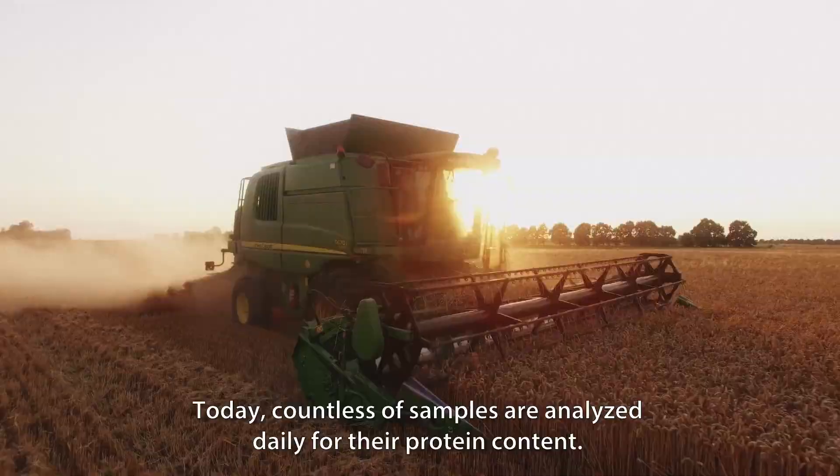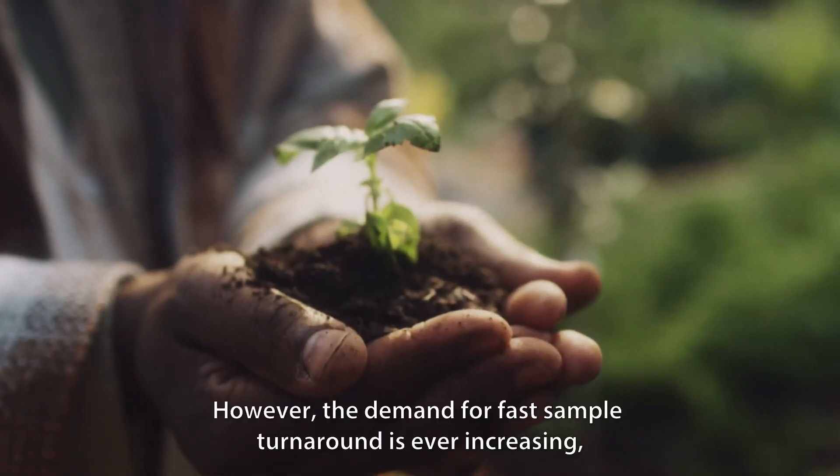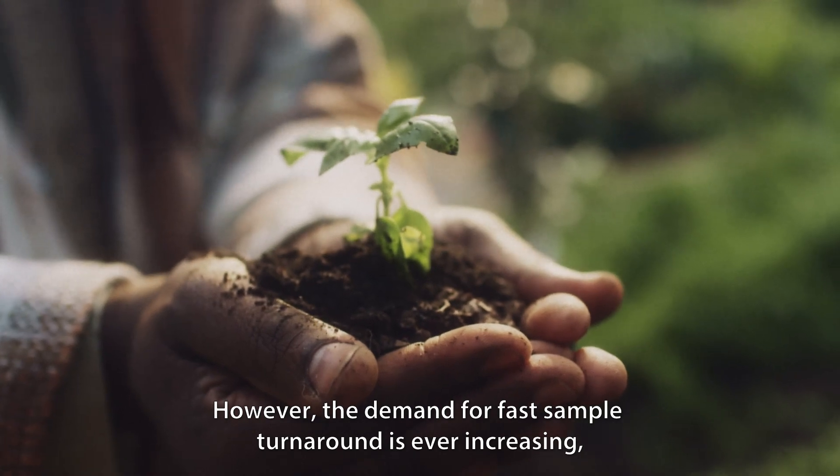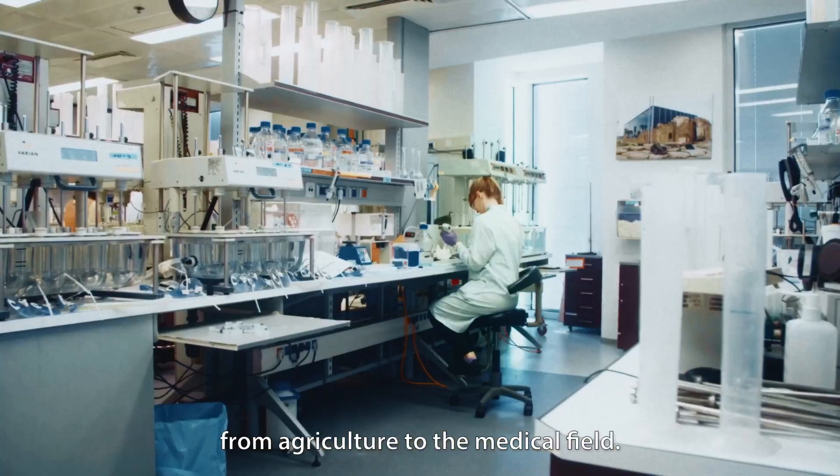Today, countless samples are analysed daily for their protein content. However, the demand for fast sample turnaround is ever-increasing, from agriculture to the medical field.